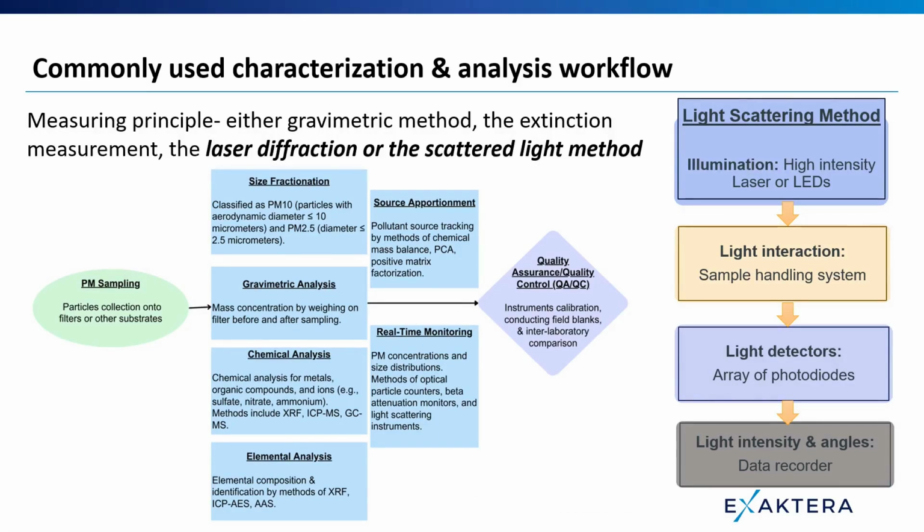There are a range of methods involved in particulate matter analysis, including some well-established alternatives to optical methods. On the left here, we've a schematic for a sampling method where particulate matter is collected, normally by filtration, and analysed later.